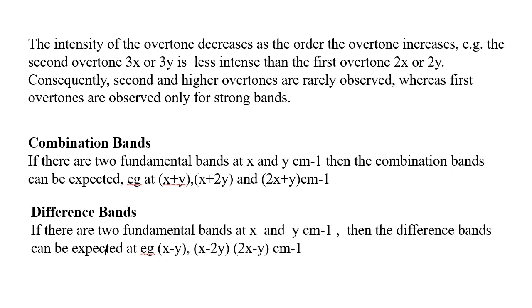Similarly, if there are two fundamental bands, one at x centimeter inverse and the other at y centimeter inverse, then the difference bands can also be expected. For example, at x minus y centimeter inverse or x minus 2y centimeter inverse and 2x minus y centimeter inverse.